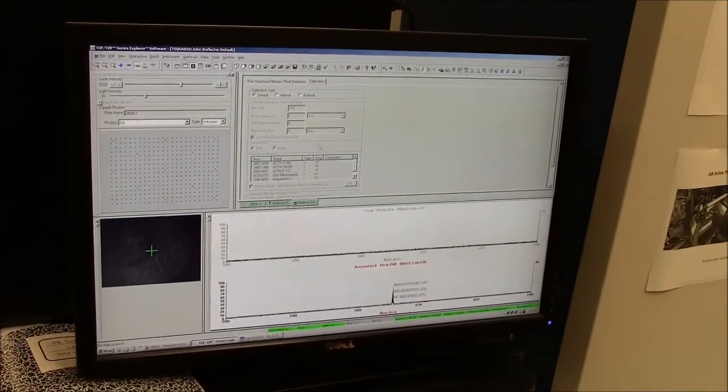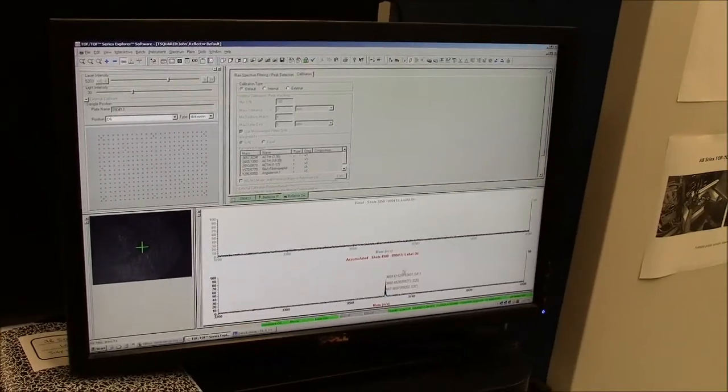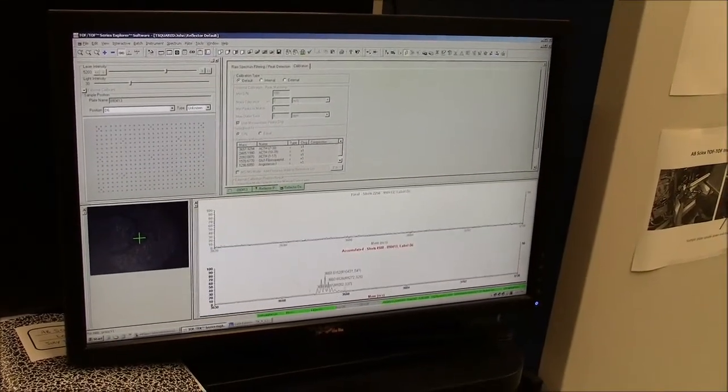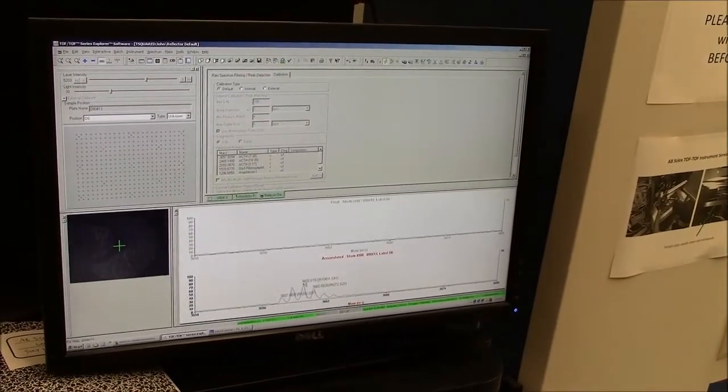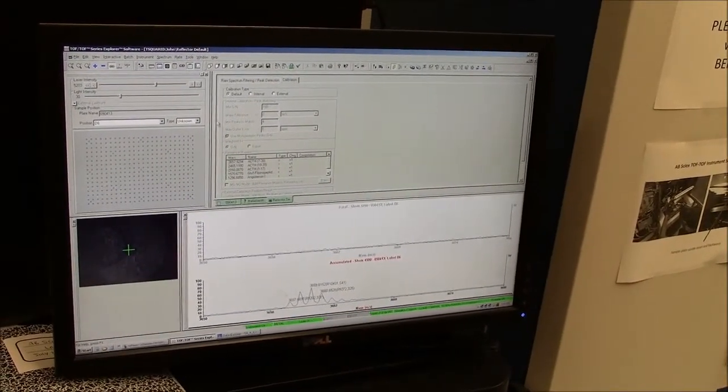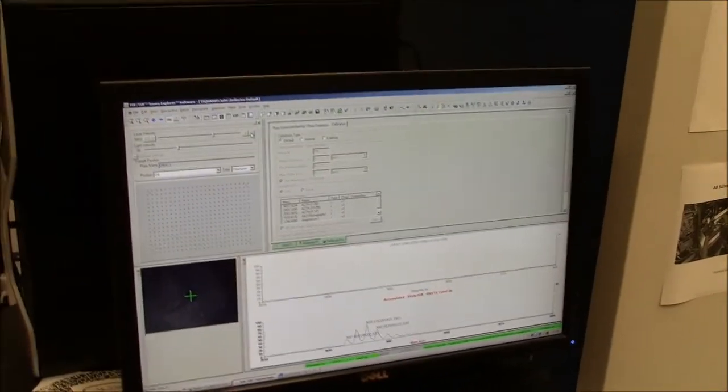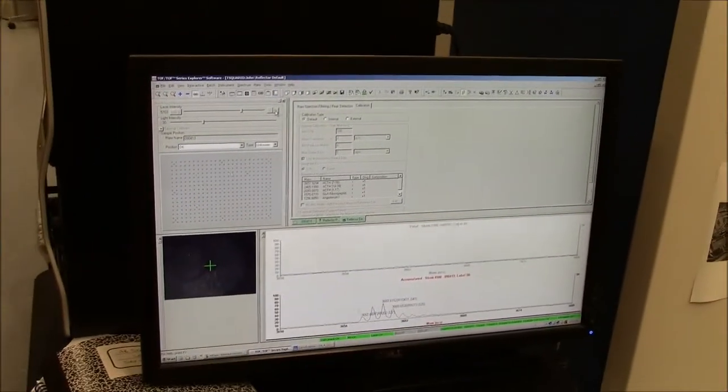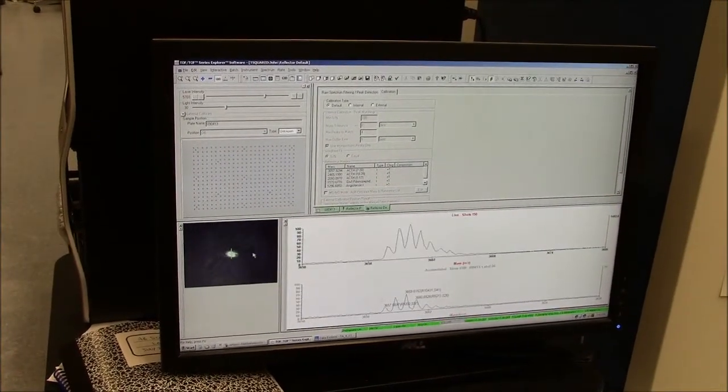So let's look at our largest peak. So this is ACTH clip 7 through 38. You can see that it is isotopically resolved, which is pretty good for a peptide that big, right? So what happens if we put in too much laser power? So let's go ahead, let's go up to like 5,700 laser power. Moderately too high.